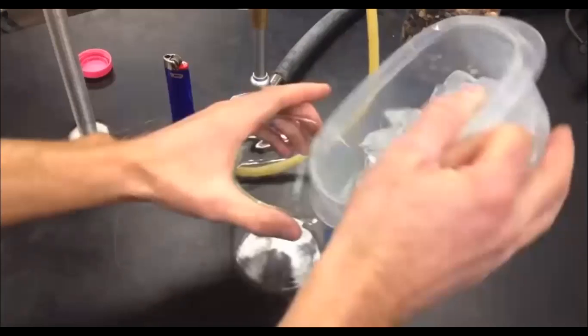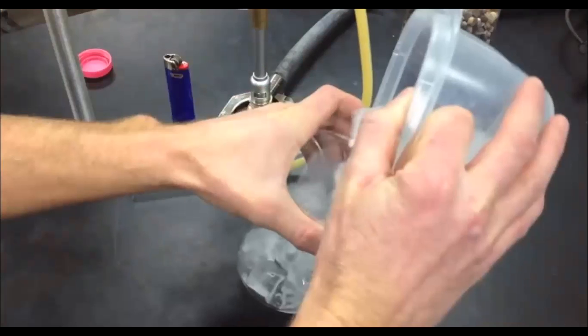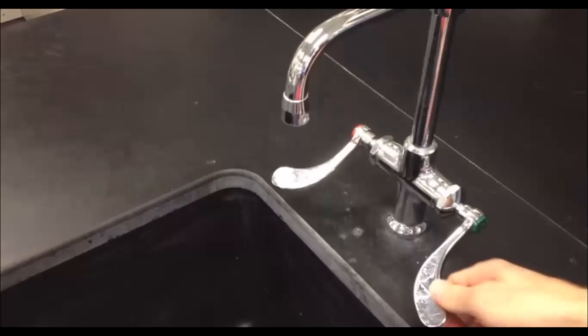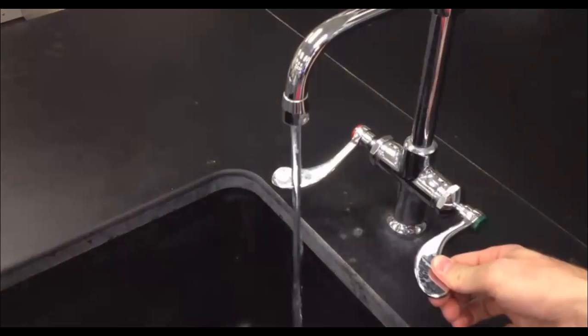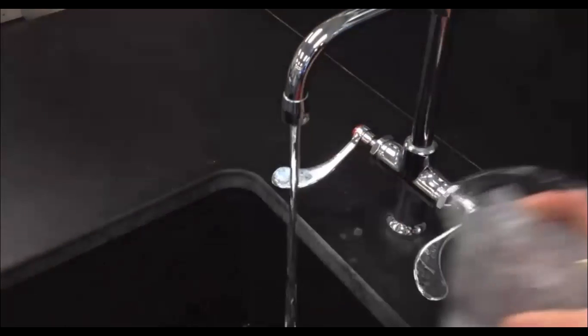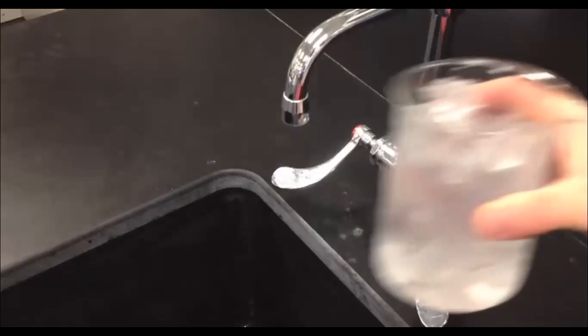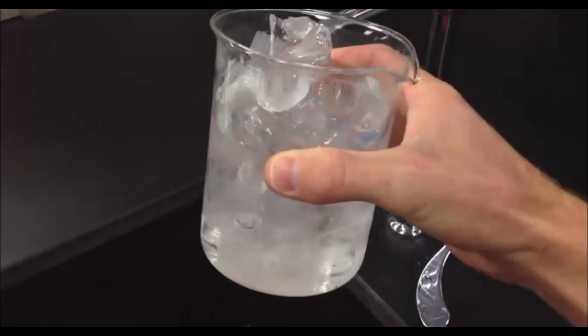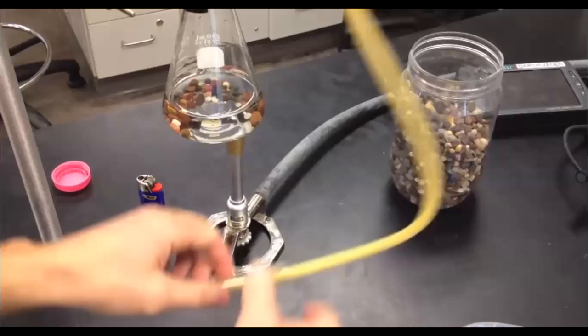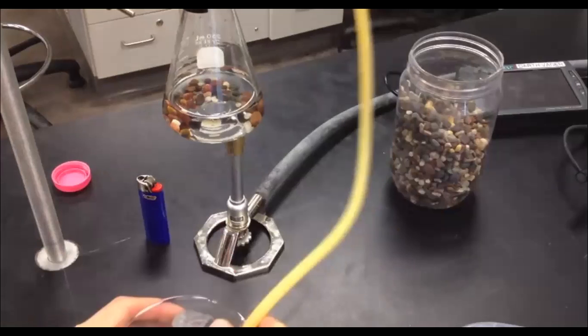So this beaker should contain ice and water to make an ice water bath. Okay, so there's your ice water bath. Go ahead and put the test tube in the ice water bath.